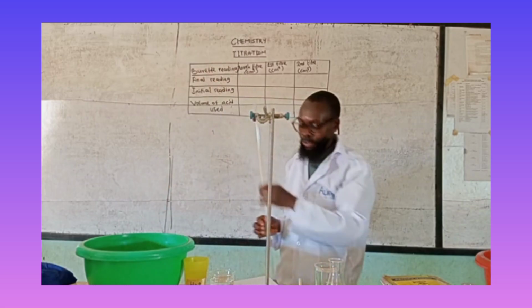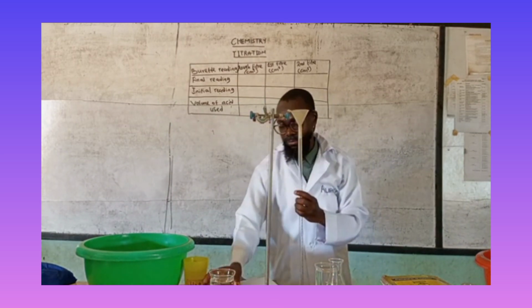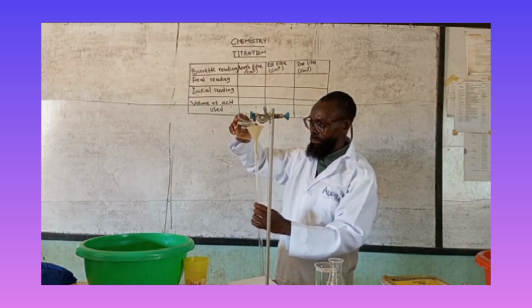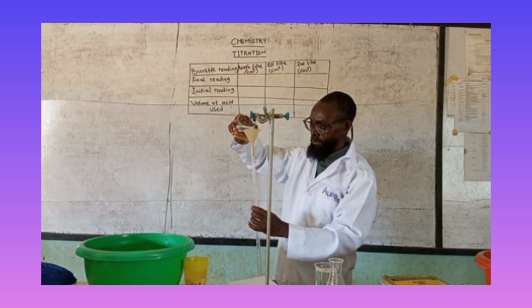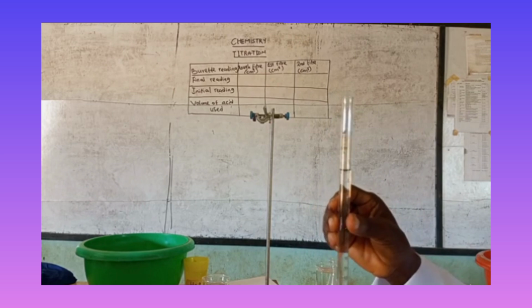Now after this, I want to start my titration. I'm going to refill my burette with my acid. Now let us look at this. I want to look at what is the number that is there.